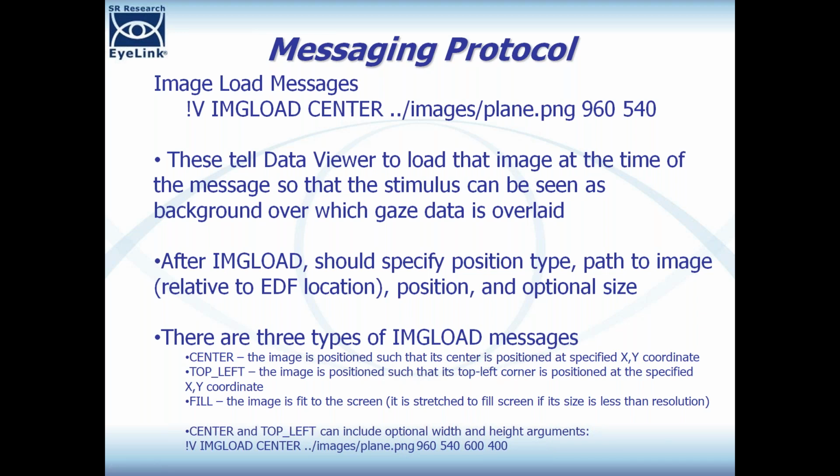So basically we'll either stretch or shrink it based on the difference between the image size and the size of the screen resolution. So there are a few different methods for how you can use this image load type of thing. I tend to mostly use the center one, but you can use any of them.